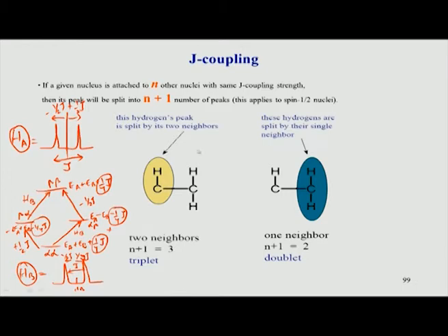We will see that in the coming next few slides. Look at this example here now. Here what is shown in this shade has 2 hydrogens, and now let us assume, as we saw here, that they are chemically equivalent. So, if they are chemically equivalent, then these 2 are considered as one entity or one hydrogen. So, these 2 hydrogens are considered together as one.